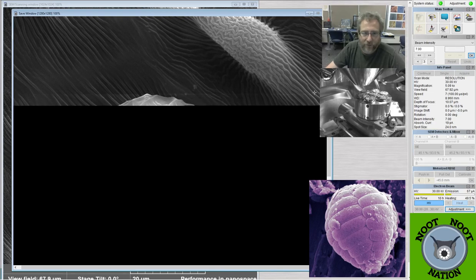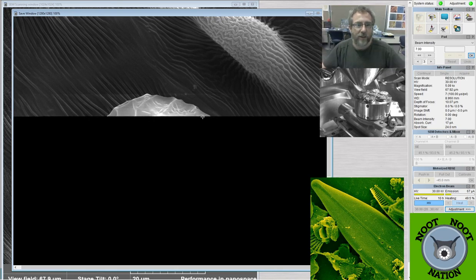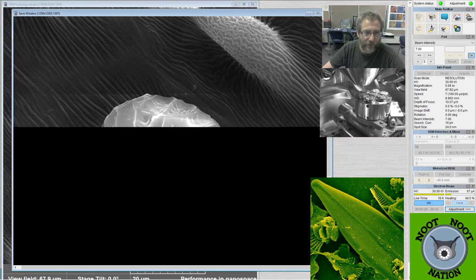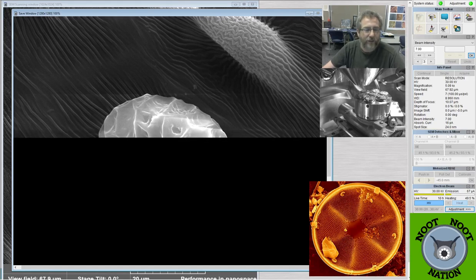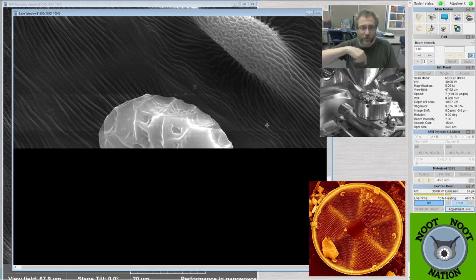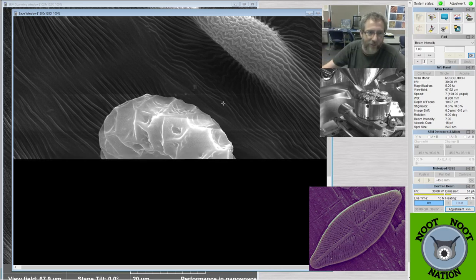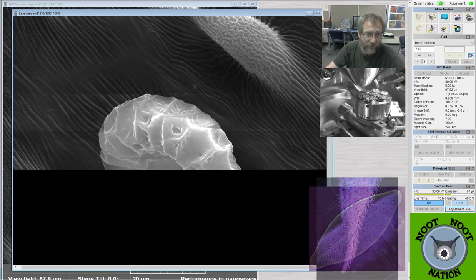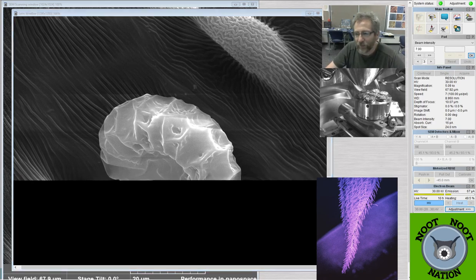And these lines that it's creating are a little bit annoying to me, but it's a byproduct of the fact that the pollen grain is sitting up on its edge. And I wanted to actually see what it looked like on the underside, so I'm just ignoring the charge line that's going across here and also a little bit through here. You can see them here as well. Because there's high points, and basically when the beam goes over it, it creates a drag effect across the little box that it scans. But I really wanted to see the underside of the pollen. It's standing up on its edge, and it's hard to do otherwise. So I'm just going to take it even though I know it's not great.